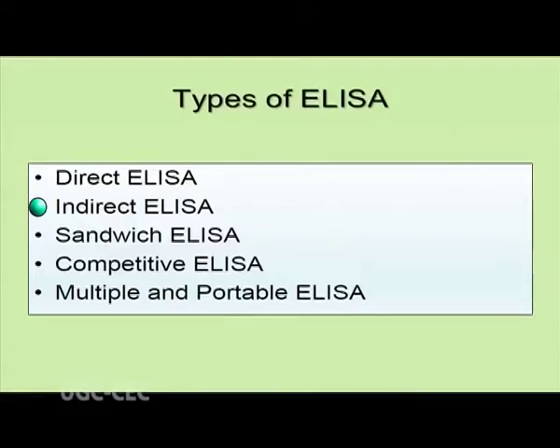Now ELISA has been developed further, and various types of techniques are available like direct ELISA, indirect ELISA, sandwich ELISA, competitive ELISA, and very recently a new technique of ELISA has been developed. It is called multiple and portable ELISA.